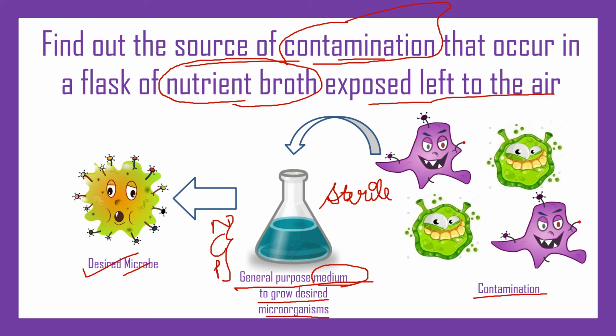Contamination means the undesired microbes. Sterile condition means there will be no other microbes present until we provide the desired microbe to grow in this medium. So we have to maintain this sterile condition and prevent this contamination, the undesired microbes.